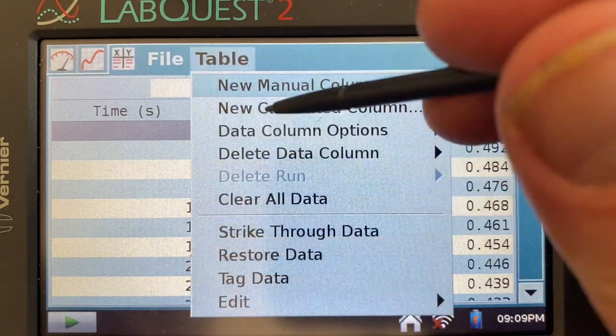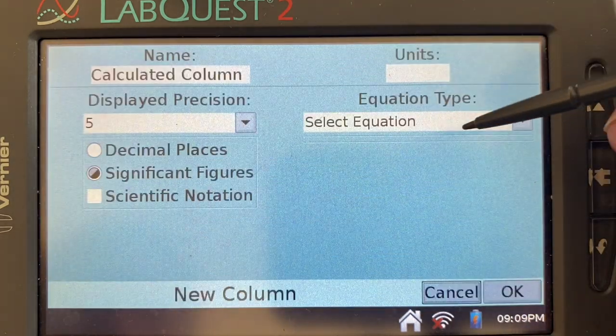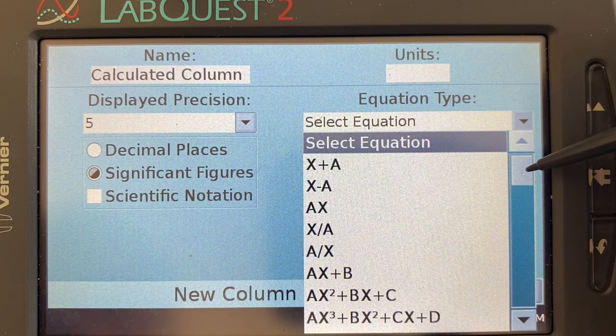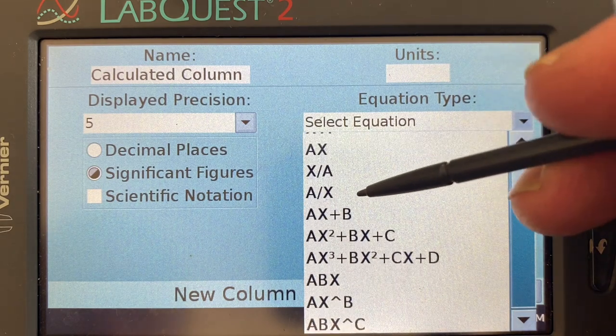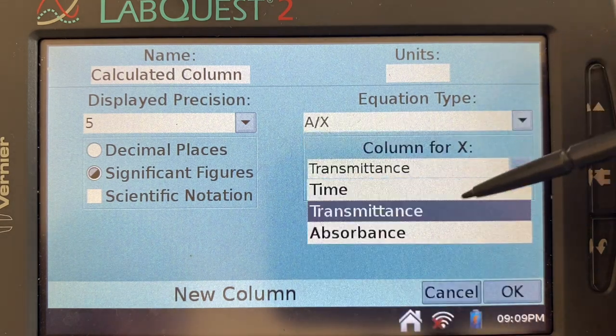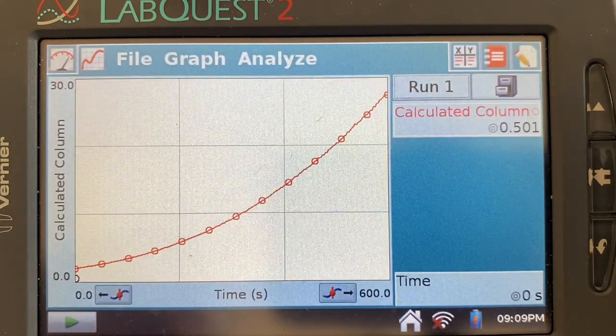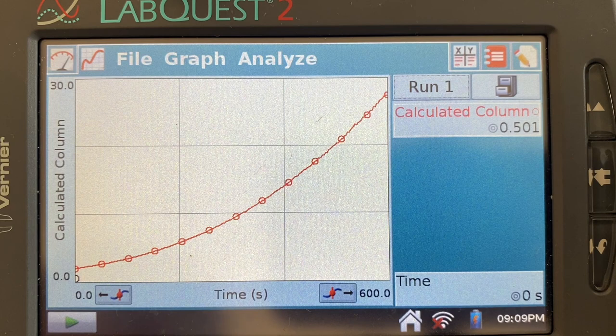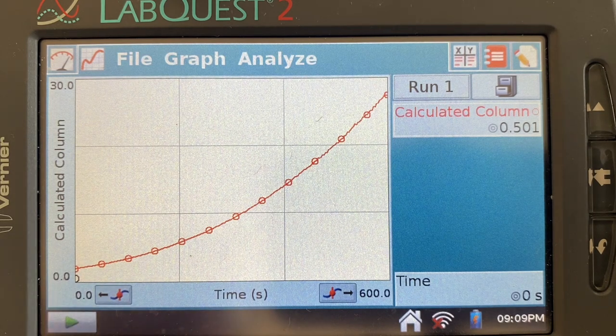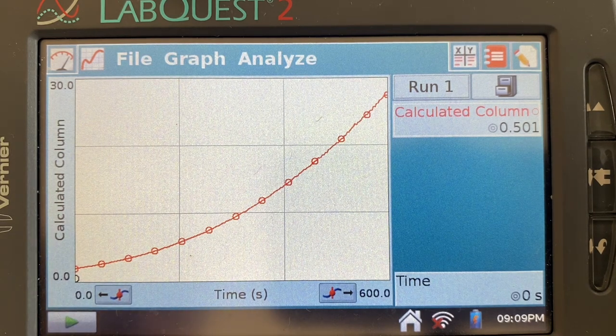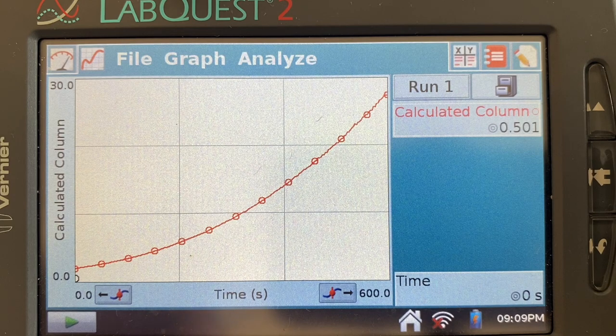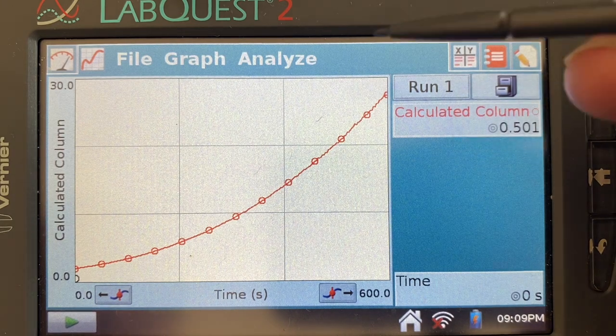So we'll go to Table, New Calculated Column. All right, and the first one I see here is the inverse of the absorbance, and so we'll hit OK. And that is the one-over concentration versus time graph. And that is also clearly not linear. So that indicates that it is not a second-order reaction.